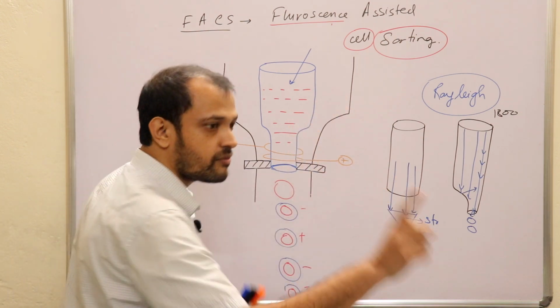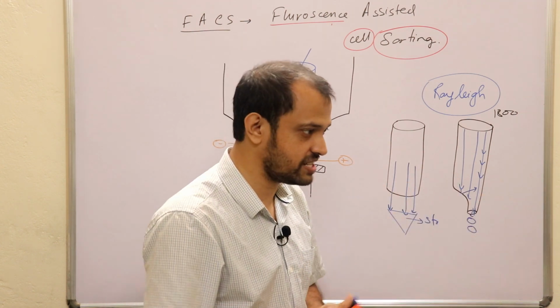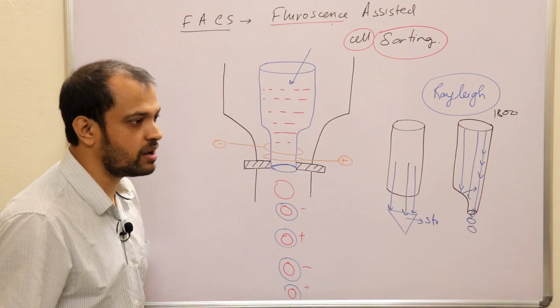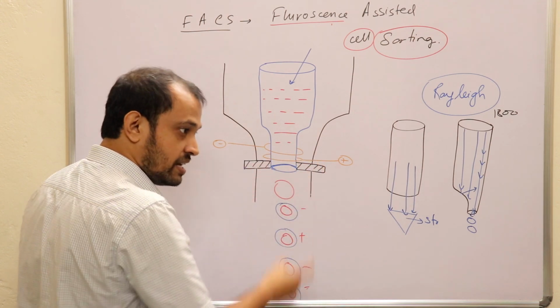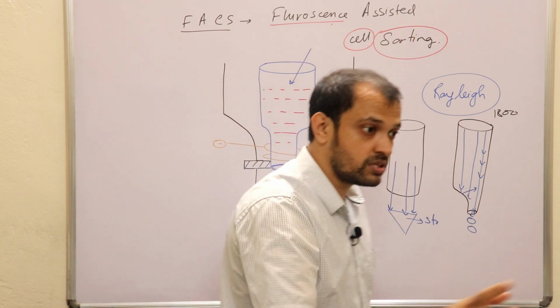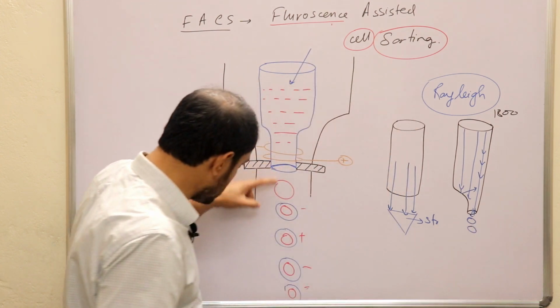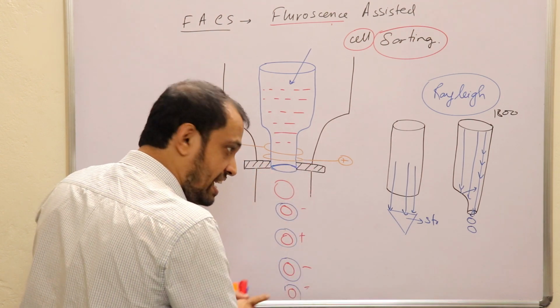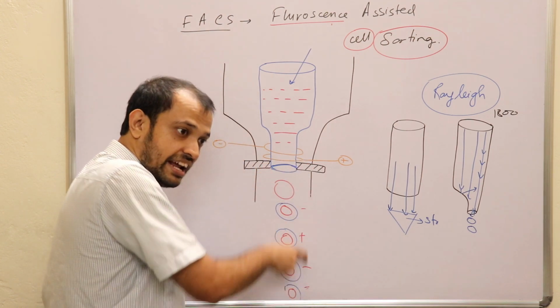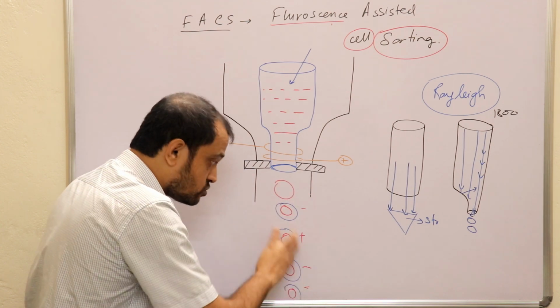Suppose we are following the basic fluidic system components, that is the flow cytometer fluidic system. What will happen? Cells will come one by one, right? But when you understood the flow cytometer fluidic system, you should have known that cells were coming in a streamline flow, single, and each and every cell was aligned in a single column, right? But there was no droplet formation.